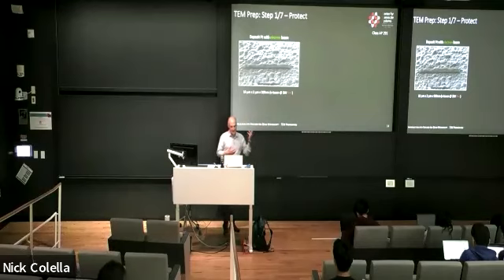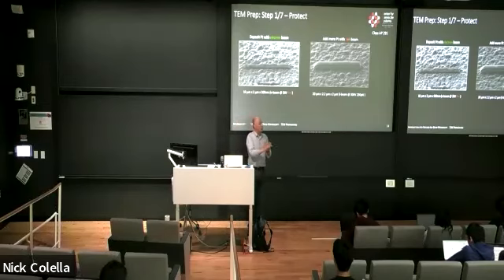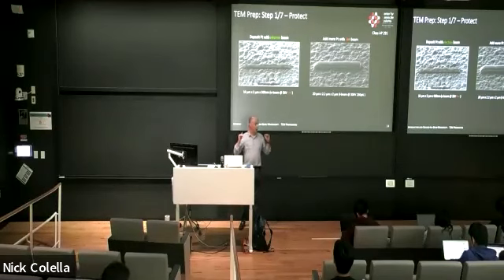As I said, we can deposit material, both using the electron beam and the ion beam. The electron beam has the nice effect that it's not damaging your material, so you can preserve your material down to the last monolayer of whatever you have.